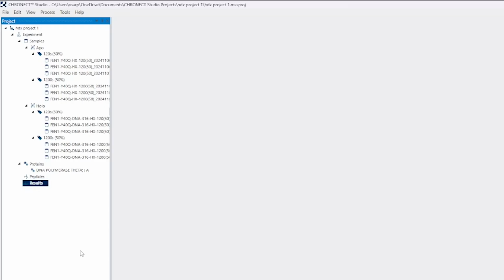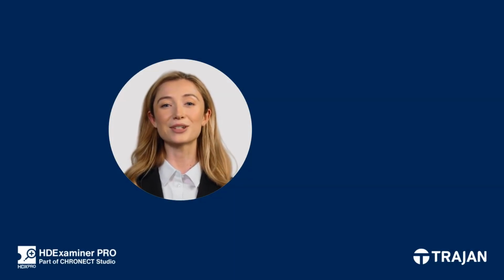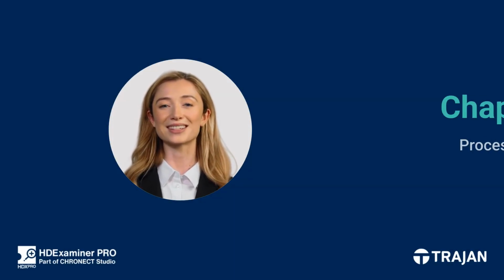As well, there's a results section here where after you process your data, each individual result will be added to the project, and you can have as many as you would need. And why individual results? Because you can process the data in different ways with different parameters and do different manipulations to each separate result. Now that your HDX project is fully set up, you're ready to move on to the next step, processing your data.